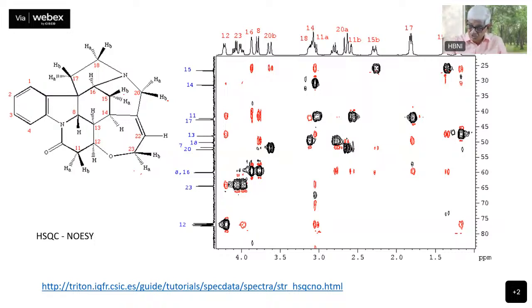Here, because of the carbon resolution which you have got, you are able to identify the individual NOEs and quantify them. These are proton NOEs only, but using the carbon resolution to individually identify and quantify them. For example, this distance is longer than this distance. That is with respect to, let us say, 15. 15 to 16 is close by here. 15 to 20 is further away. This one is further and this one is closer. This intensity is higher than this. So you can put qualitatively these intensity patterns in the computer to build the models.